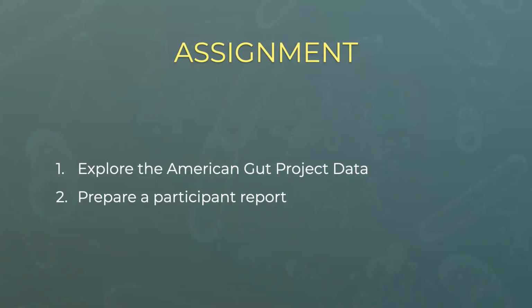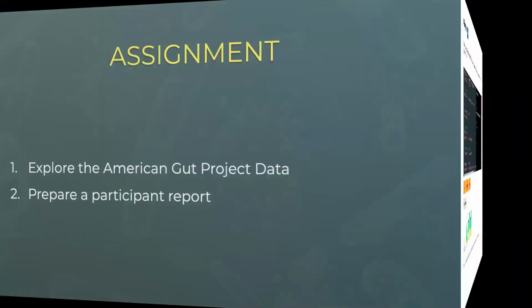This could be a report based on what you found as an interesting participant against everybody else. For example, out of the 17, maybe you could find one that stood out to you and compare them to the rest. Or you could just divide up the two groups and say, okay, here's how the two groups compare. Since I see Mikhail has done this, but maybe some other people had trouble or have not had the time to look into it, let's briefly take a look at how we can do this together.